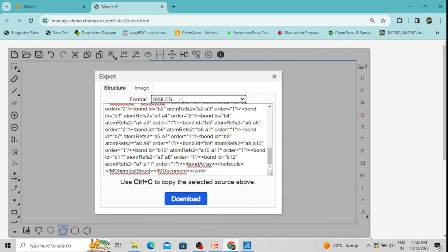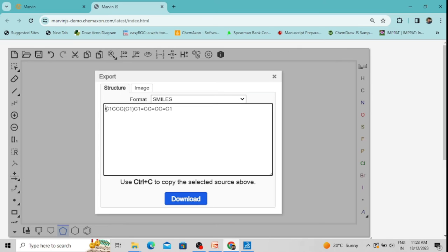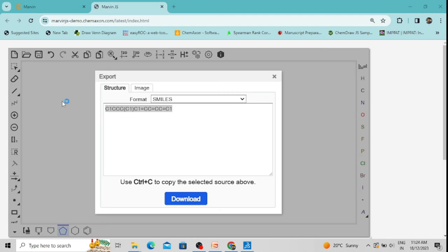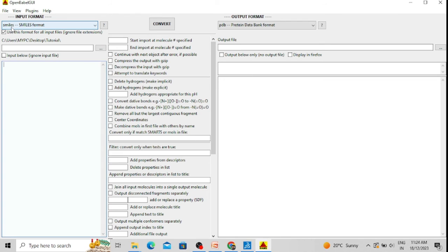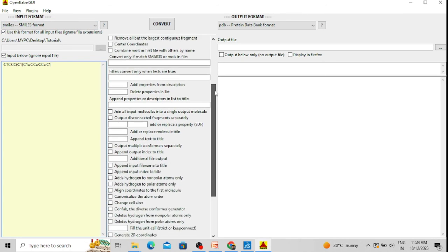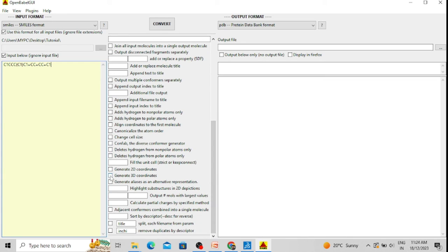I am drawing a random chemical compound structure in MarvinSketch. Now I am saving this structure — the format can be selected from a list. I am selecting the SMILES format, which is a two-dimensional structural file format, and copying it. In OpenBabel, I can convert it into a 3D structure. I have selected SMILES as the input format, pasted the SMILES string, and I want to convert it to PDB format. Since this is a 2D structural file format, we have to select the option 'Generate 3D coordinates'.